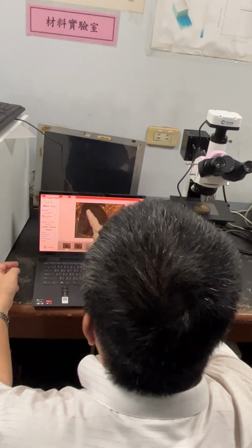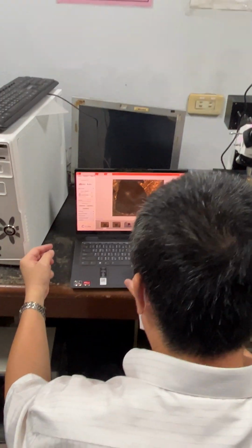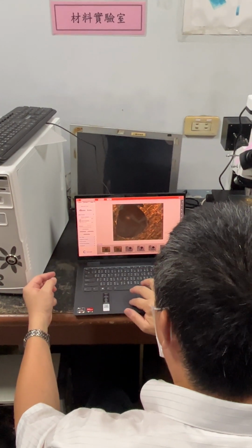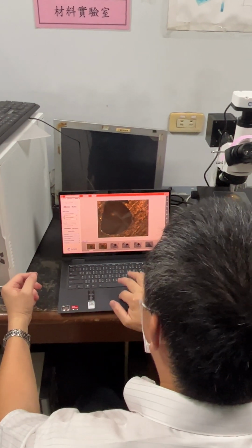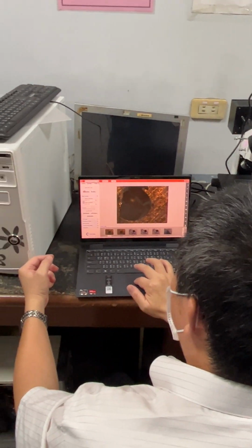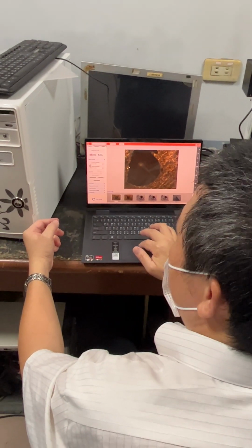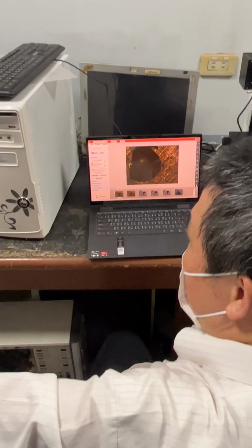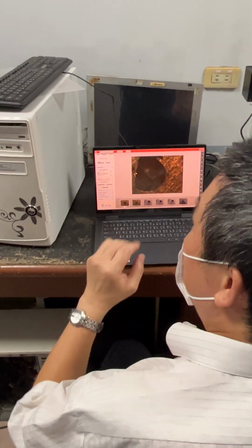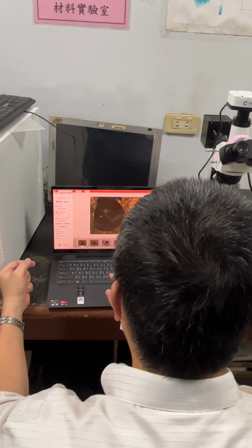Okay, so we can see very clearly that for the Vickers indenter the mark is square, like all these saved before, so it's fine. For this one, it's not fine. You can see here that it looks like it has some kind of crack or is broken already, and that is why we compared our results with other companies and found out that it's different. I think it's because the indenter has some kind of damage already.